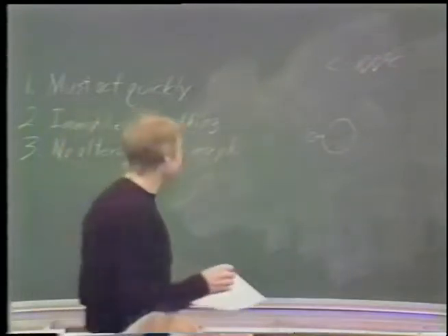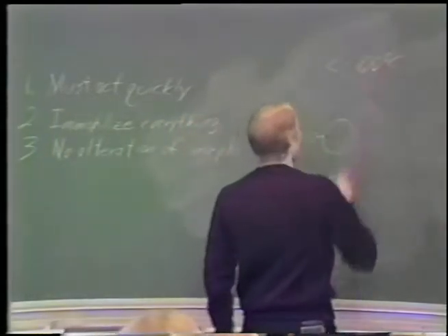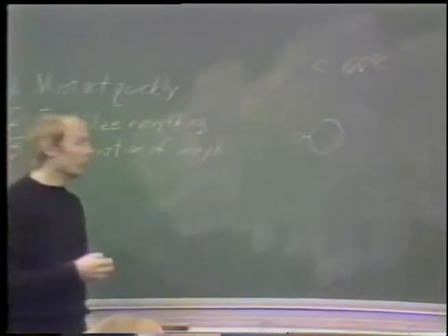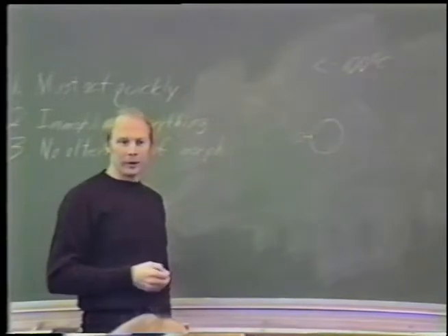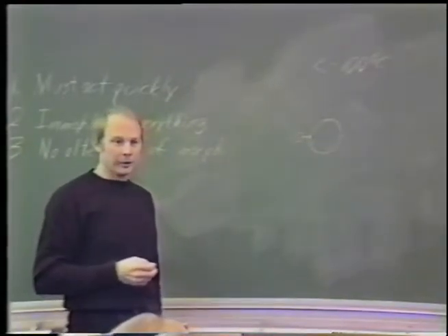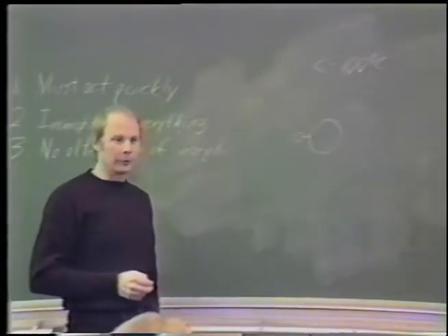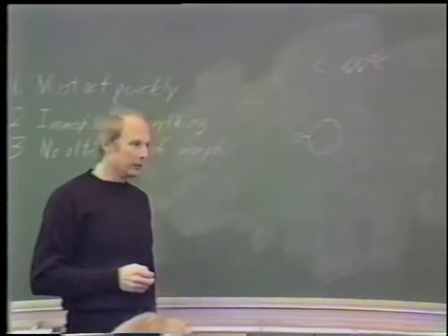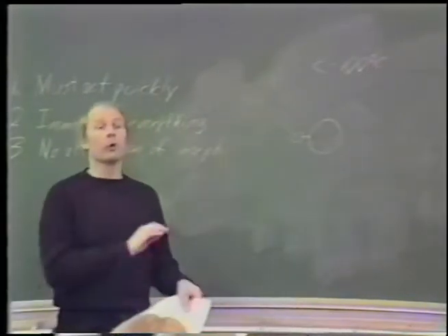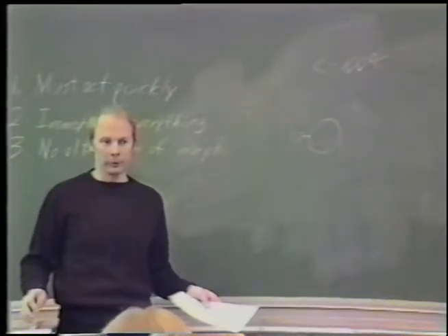Okay. That's new. Now, for a long time, people thought that you had to keep the samples below minus 100 centigrade to avoid growth of the ice crystals. And that was because people thought the samples were actually vitrified. Now, if you do make vitreous water, and there aren't very many good techniques for doing that, you find that pure water, when it's vitrified, will rearrange. This is an amorphous system, with no ordered domains detectable.